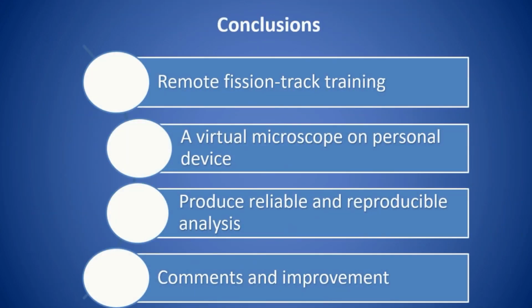What we are proposing here is a training module specific for remote learning. By using a virtual microscope equivalent software, users can carry out the exercise anytime, everywhere. The goal is to equip researchers with the confidence and the skill to produce reliable and reproducible analysis. We understand that all the labs have their own recipes in terms of training. This module is currently being tested on both experienced conventional fission track analysts and totally untrained students. We are hoping to reach a version of much improved content and usability at a later stage.